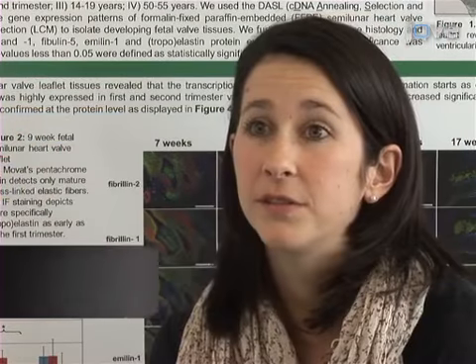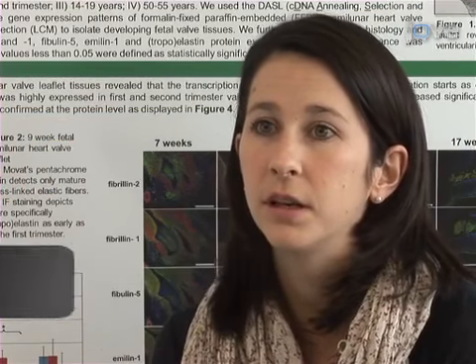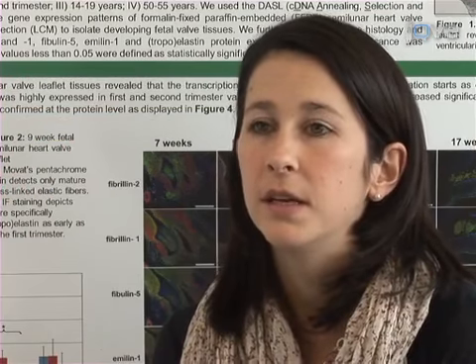The main advantage of this technique over existing routine methods, such as histology and immunofluorescence imaging, is that no sample processing is required. Though this method can provide insight into single-cell state and extracellular matrix components, it can also be applied to multicellular tissues and organs.